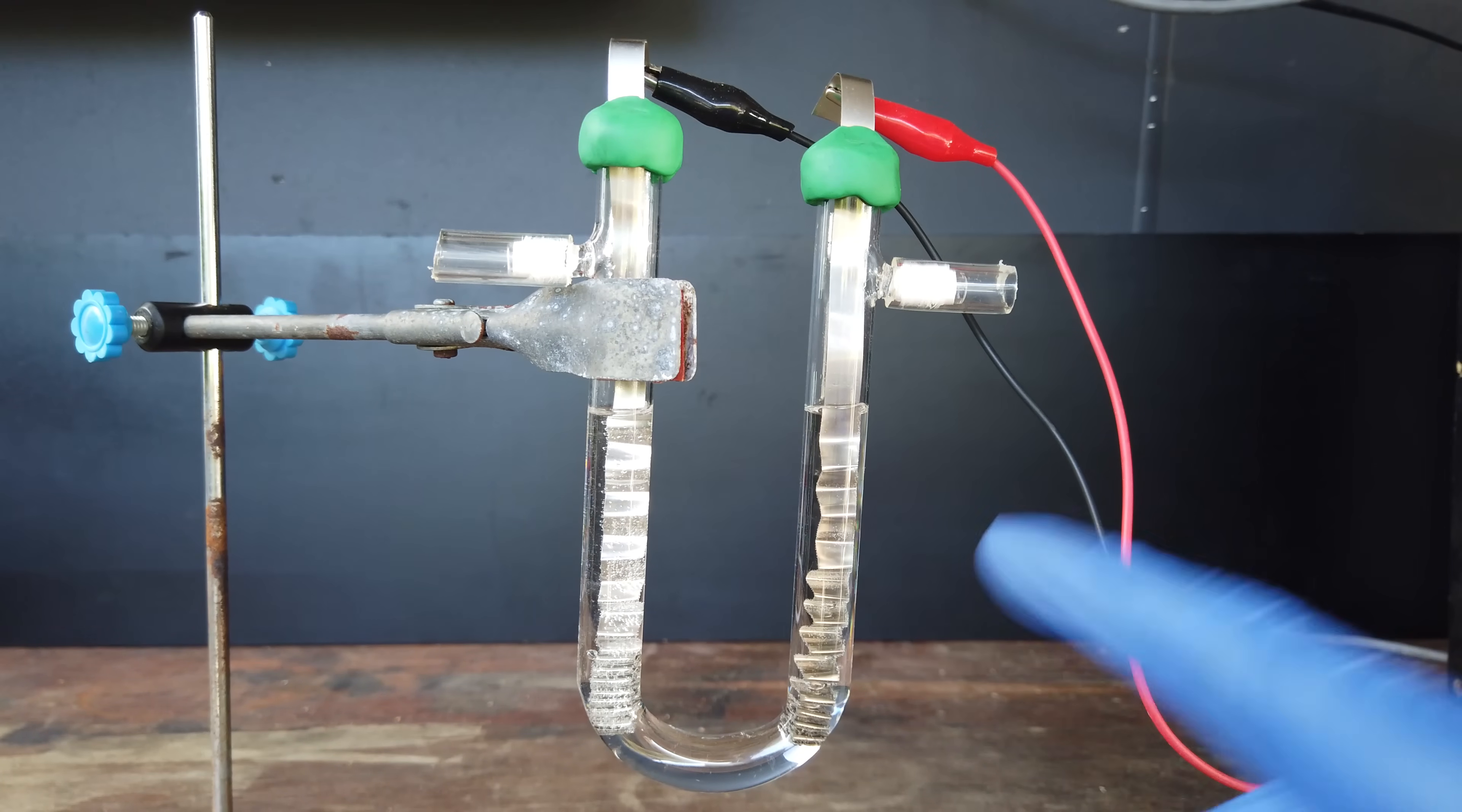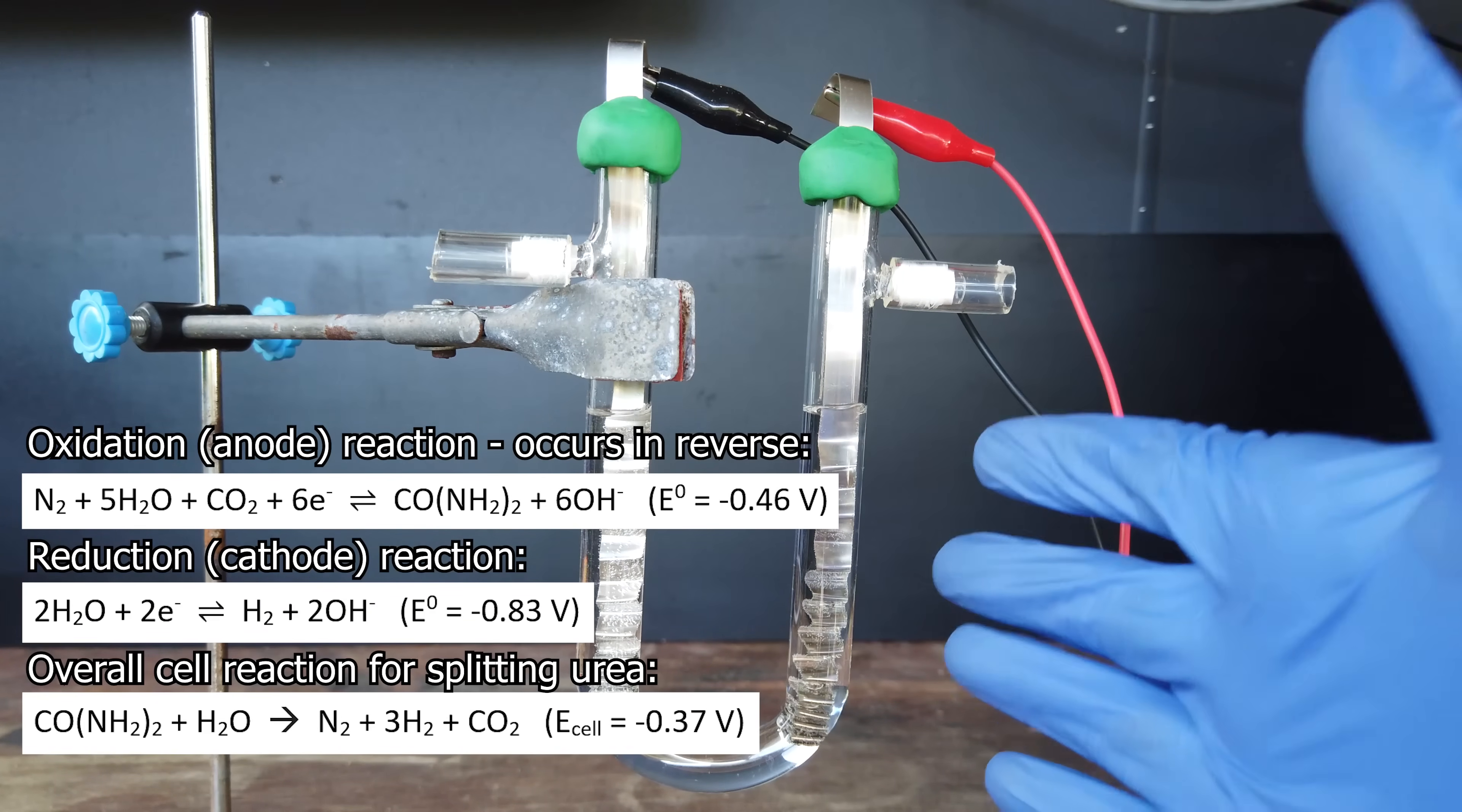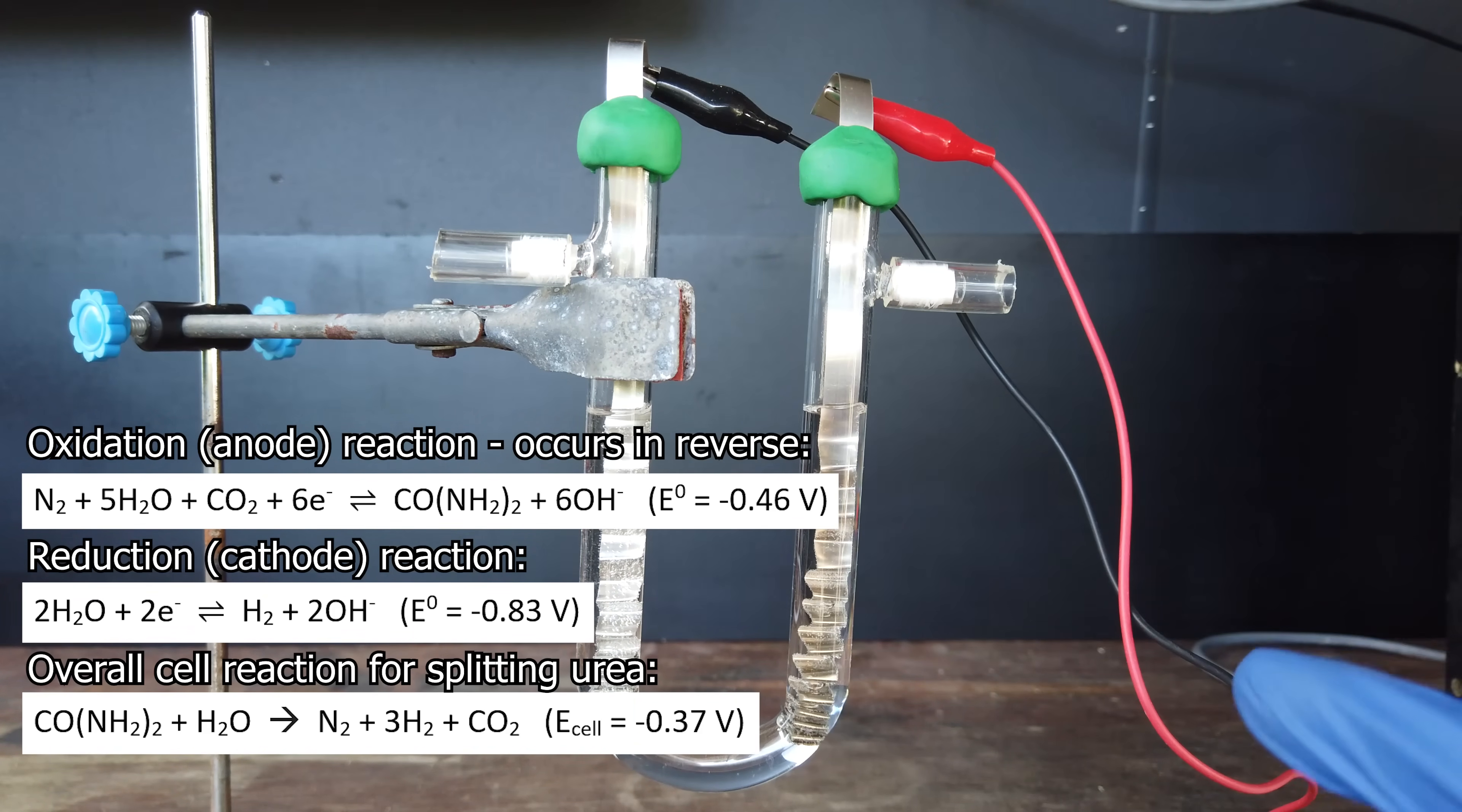However, there's a problem with increasing the voltage past 1.5 volts, and that is the fact that voltages much higher than 1.5 volts will start electrolyzing water itself to quite a significant degree. While electrochemical splitting of urea is actually incredibly easy in terms of energy requirements, thermodynamically, the minimum voltage required to split urea is around 370 millivolts. So 1.5 volts is definitely in excess there.